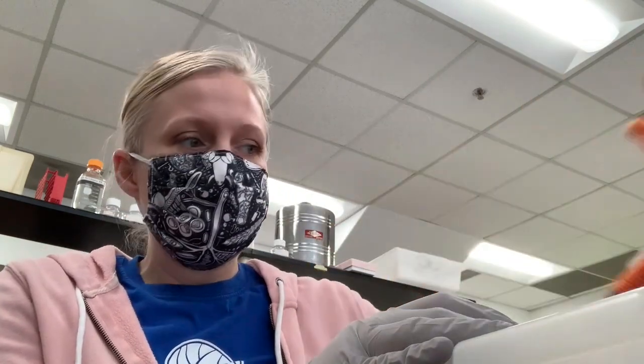Okay, so I'm going to go upstairs to the 6th floor with my tub and my gloves and my solutions. You can also autoclave dry materials like empty bottles, or we use the autoclave to sterilize our tips. So you can also use the autoclave to sterilize things that are not liquid solutions. So I'm going to take you up there to the 6th floor and we will run the autoclave.